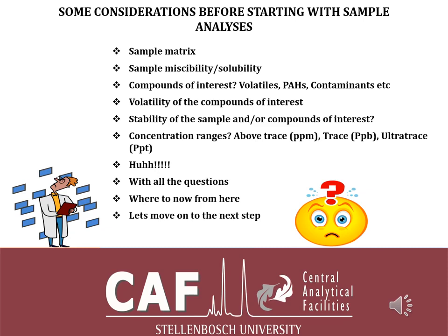And also, it's important to know the miscibility of the sample. Is your sample soluble in an organic solvent, or in an inorganic solvent? If it's an organic solvent, what is the polarity, is it polar or non-polar? Of course, that will help determine which solvent to use.